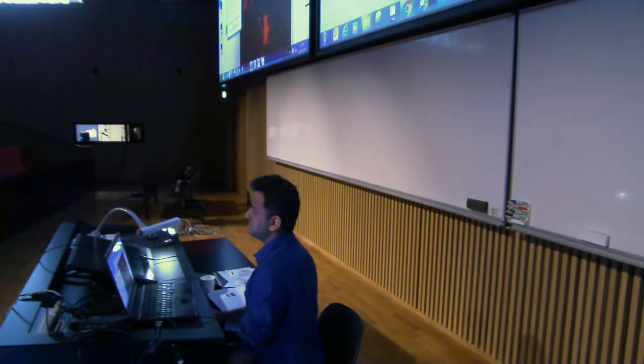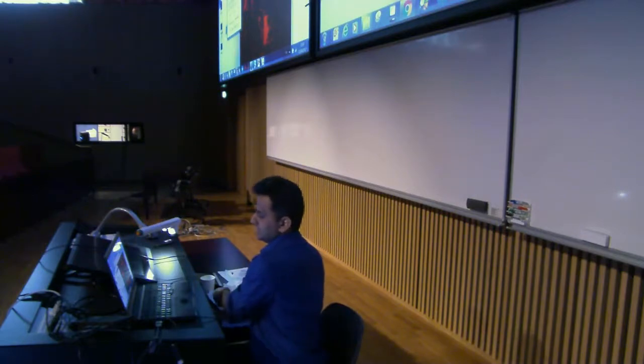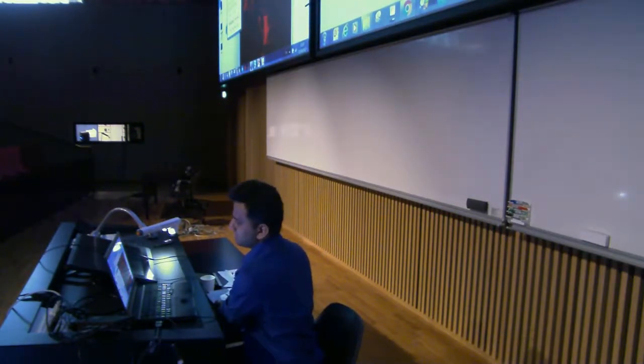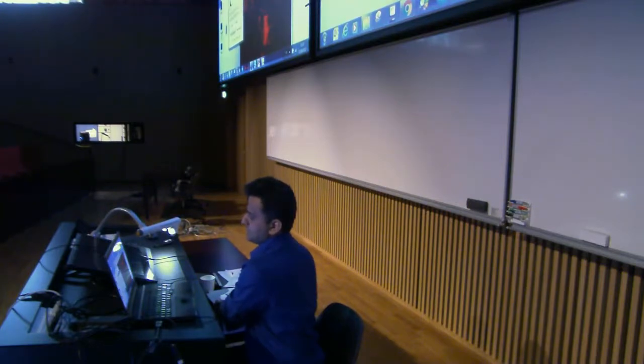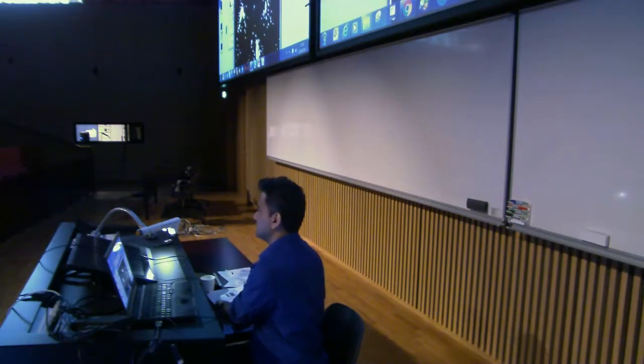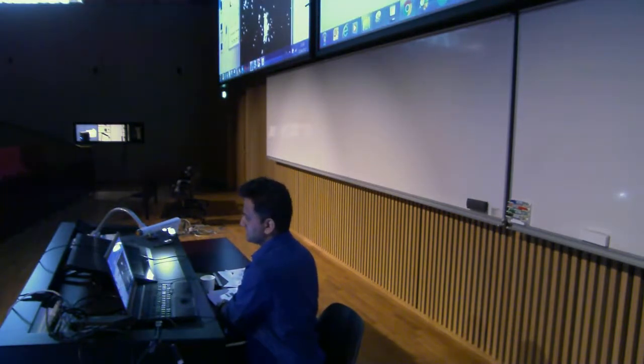And it's a dark background, right? And most of the fluorescence, they're dark background, right? Unless this is DIC, then you might want to switch off this, and then it becomes the white background. But when you hit apply here, then it will create a mask. You see here now? And then you can put this mask on your raw data and then analyze your data. So this is basically segmentation.